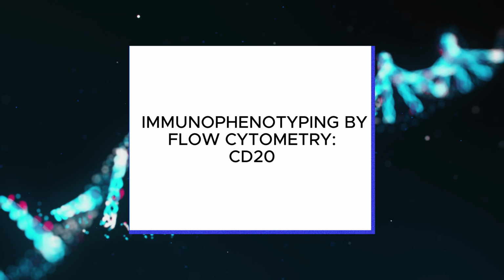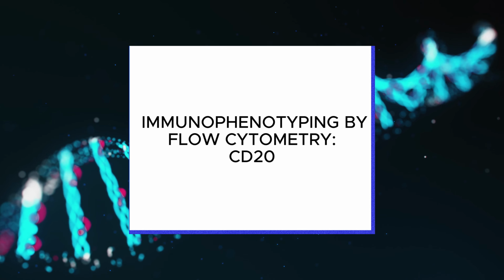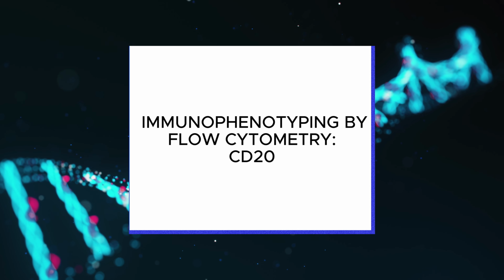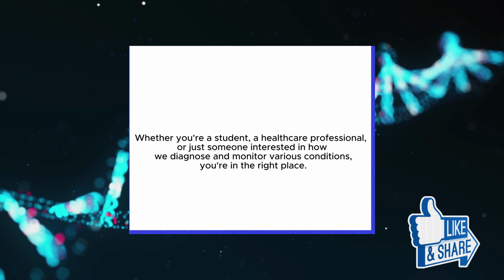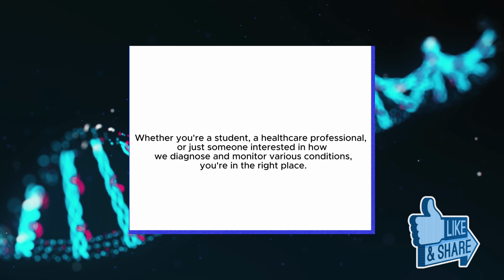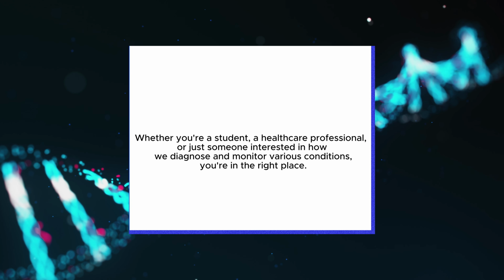We're diving into a crucial diagnostic tool in immunology and hematology, the CD20 test via immunophenotyping by flow cytometry. Whether you're a student, a healthcare professional, or just someone interested in how we diagnose and monitor various conditions, you're in the right place. So, let's get started.